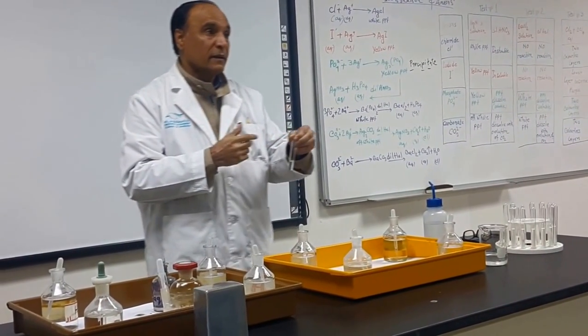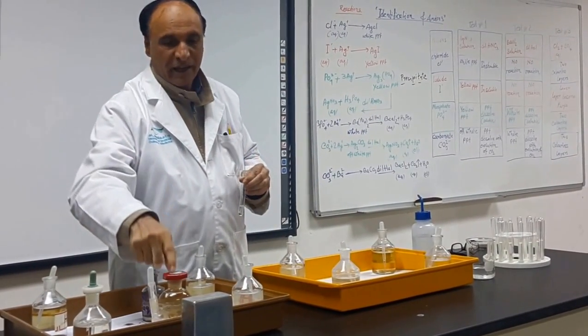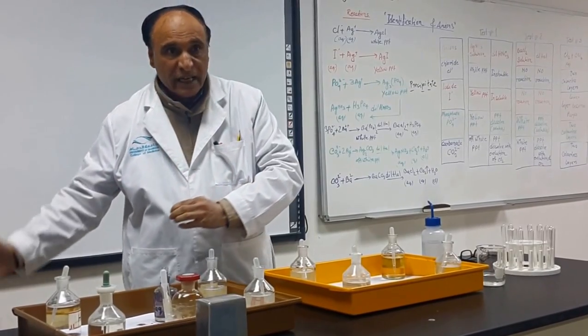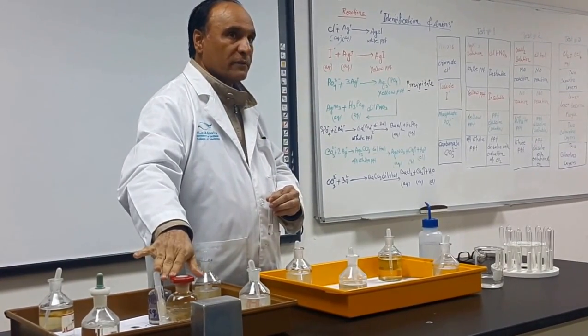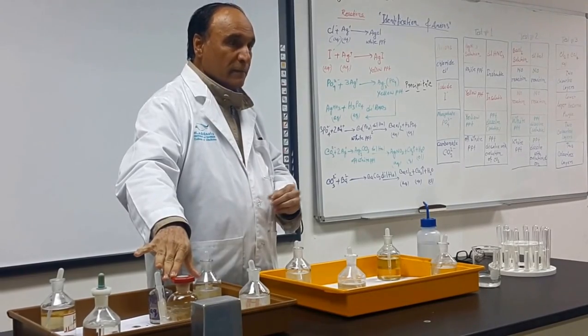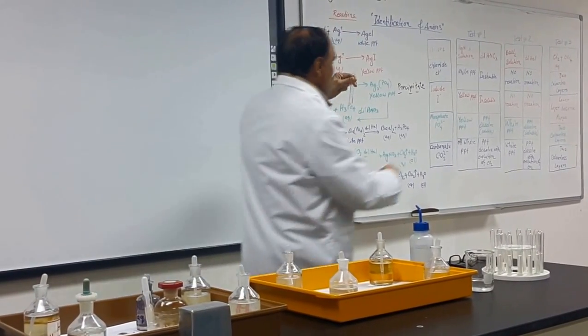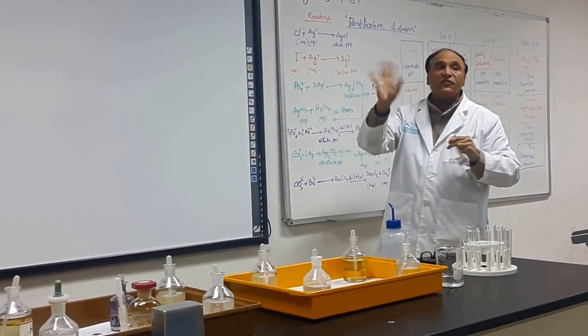I can smell it. Don't do any favor for your friend, saying okay, I have kept it open for you, take it and I will close. No, he will come, although he is standing near you, he will open it and he will close it. Did you understand? This is chlorine inside. I put in the chloride. Here is the chloride. That is chlorine. Absolutely different things.